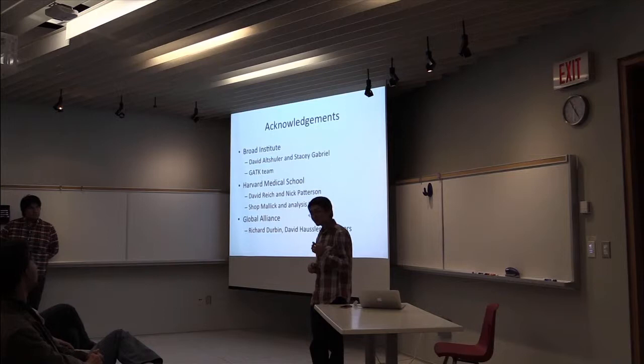I think the best assembly can be achieved by combining the Illumina data and the PacBio data. If we combine them properly, I think we will get something better than the current reference genome. But now I think it's kind of on par. It's better in some ways, but worse in others.